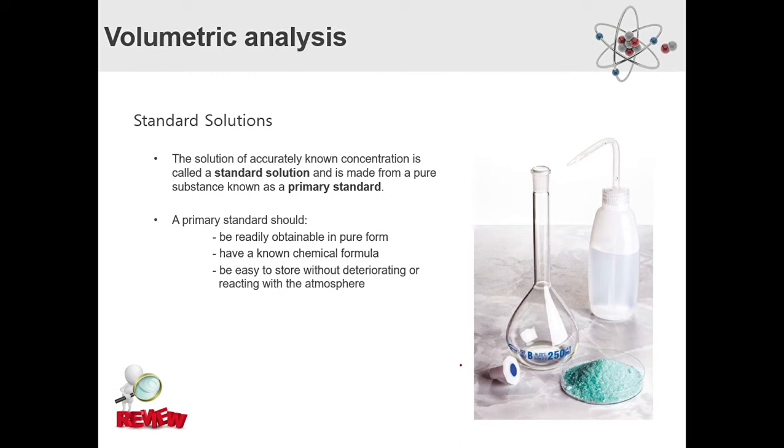The reason for this is if I go into the back room of my school and I want to get a standard solution, I could either do one of two things. I could take one that already exists from the cupboards underneath, or I could take the chemical itself and put it in water and make it up to a certain concentration. I would do the latter because I don't know how long the solution has been sitting there. I didn't personally make it up myself, so I don't know what the concentration is going to be or how it's been affected over time. For this to work, we need to know how much chemical we have in the water it dissolved into solution.